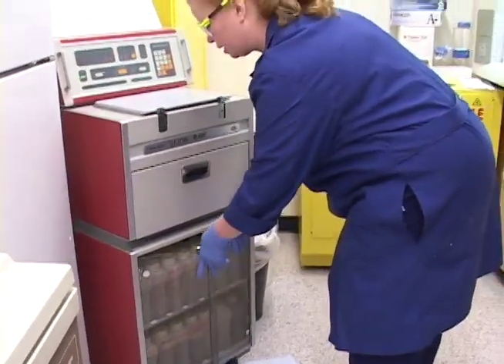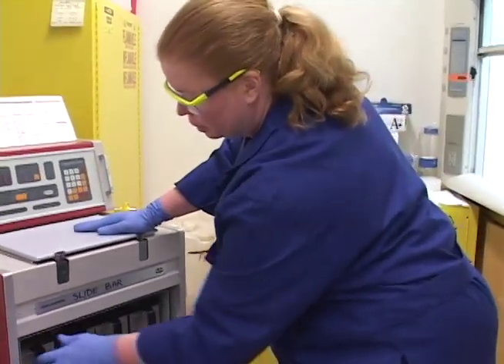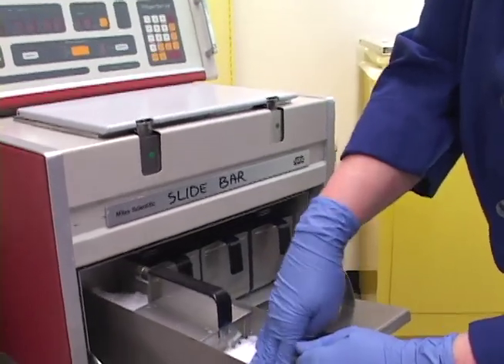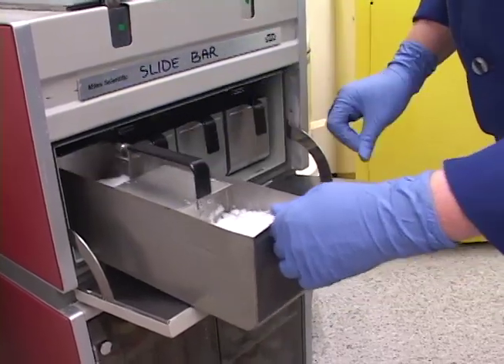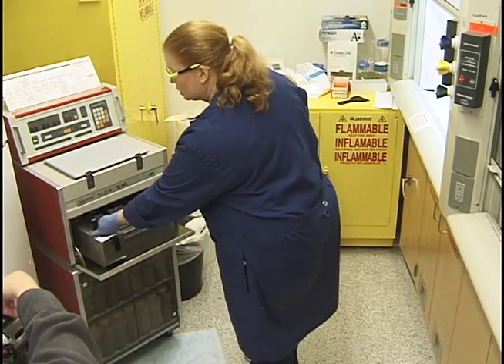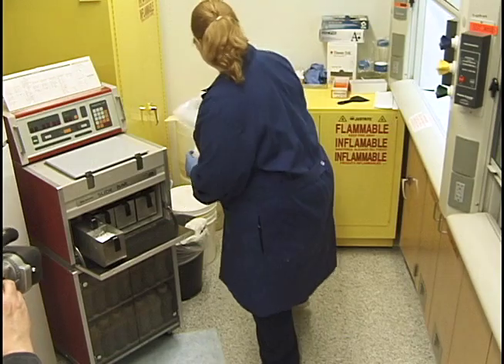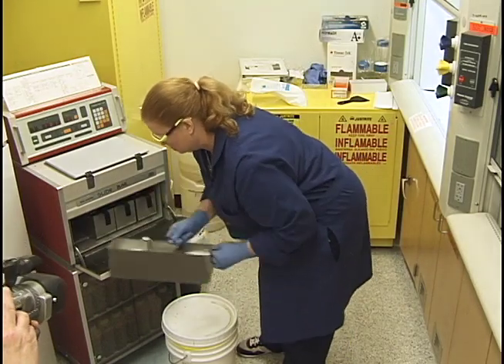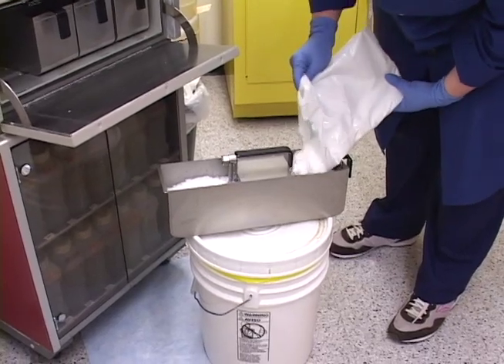Now we're going to revisit the paraffin because remember I told you it wouldn't be melted enough. You can see it's melted down some and it'll be even less than what you see now. Before your next change, make sure this is filled to the line with melted paraffin, so we'll put some more paraffin in there to get it melted and fill it up again.